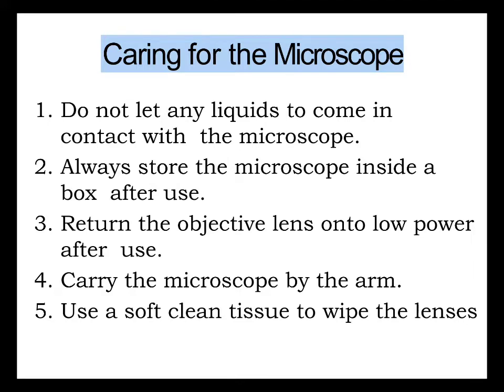So why do we need to properly care for the microscope? Number one, a microscope is very expensive. Number two, so that it can have a long life, and we can still use it for a long time. And number three, for us to see more objects or more organisms that we're going to study.